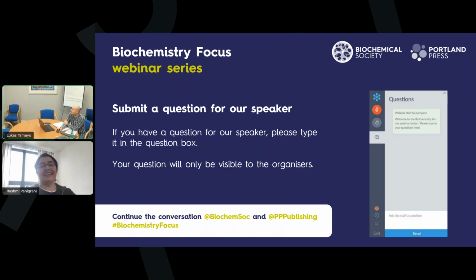Yeah, thank you for the question. And you're right. Actually, in our case, to avoid that, we used a labeled system. So it was not label free. The histidine tag of the BRCT was labeled, and that avoided that kind of bias. Okay, thank you, Rashmi.